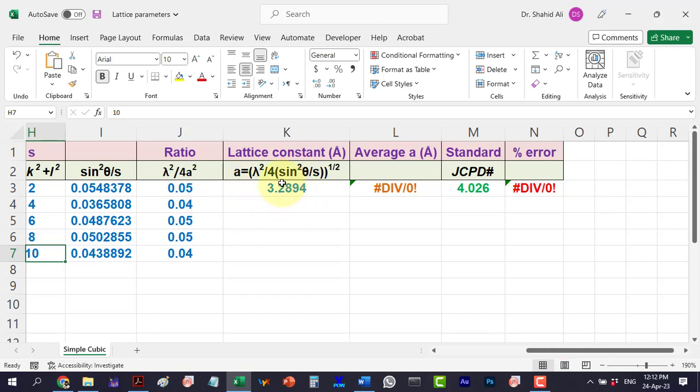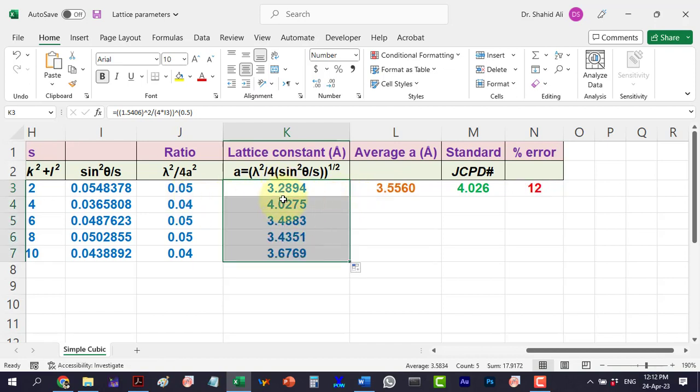Let's calculate the lattice constants. Here for average, we prefer the large angle values. So, the average lattice constant comes out to be 3.56 angstrom.